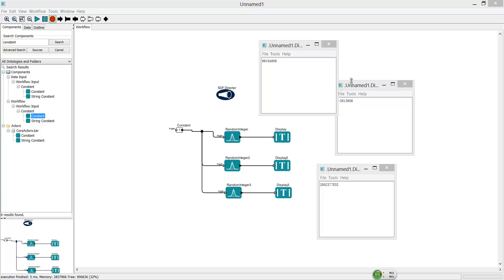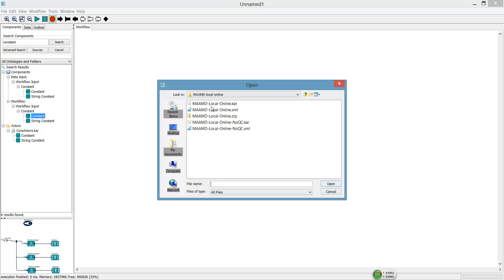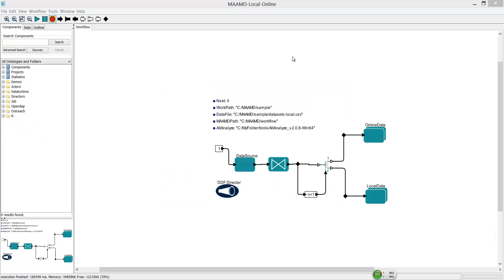This is an example of how Kepler workflow works. Now let's turn to MAMD, which is a Kepler workflow used to integrate microarray data and their analysis.